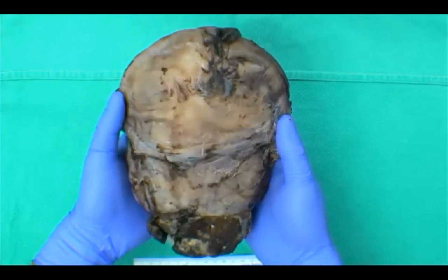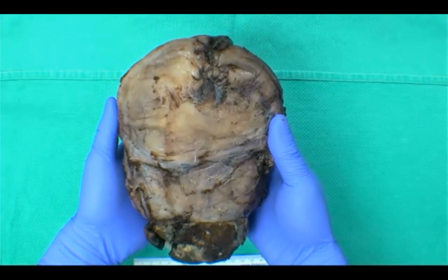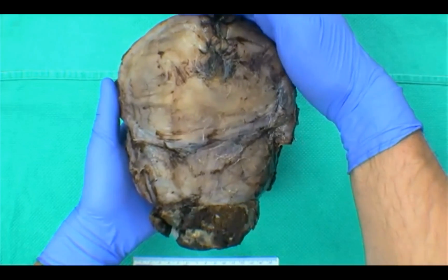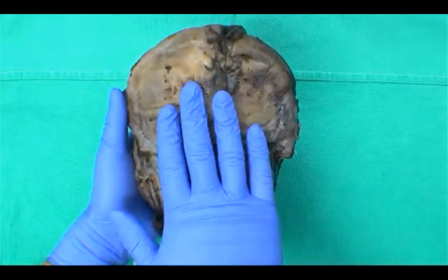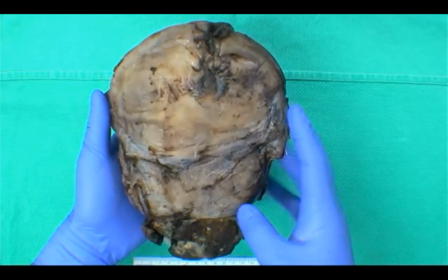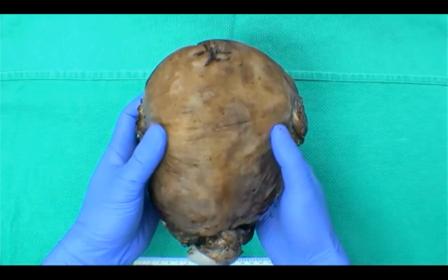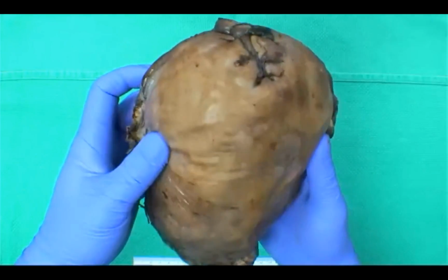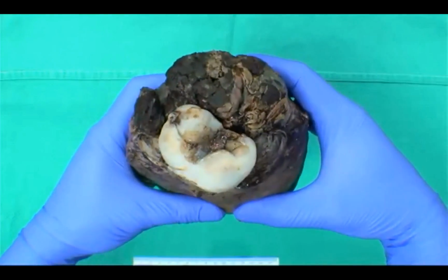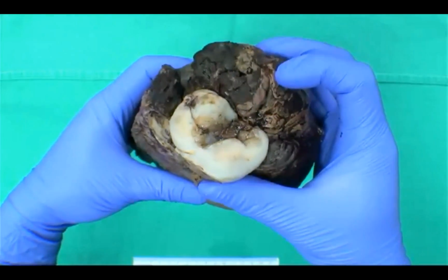I think everyone understood what the specimen is. This is a total hysterectomy, or a uterus with attached cervix. For orientation purposes, this is the fundal aspect, or the superior aspect. Right now, looking at the anterior surface, this is the inferior aspect down here. Flipping it over on the posterior aspect, you can see the nice smooth and tan serosalized surface. At the inferior aspect, you can see this is the exocervix with the os in the middle.